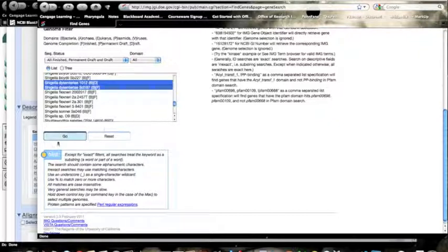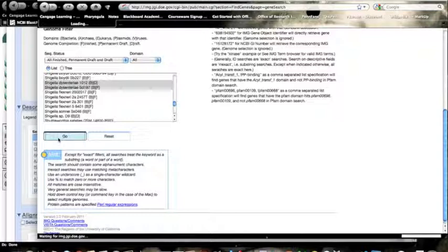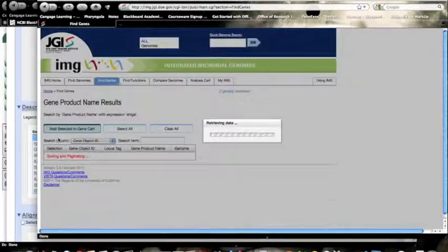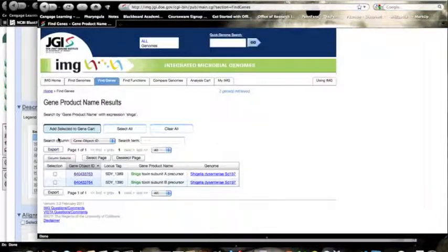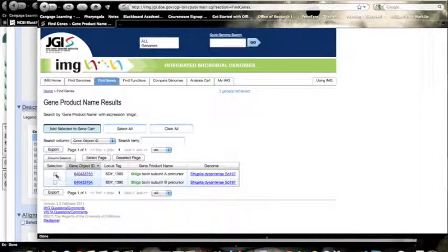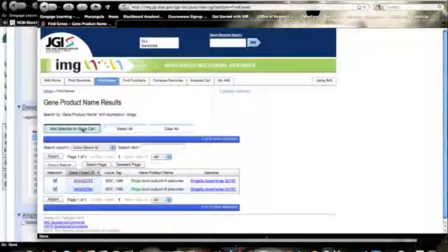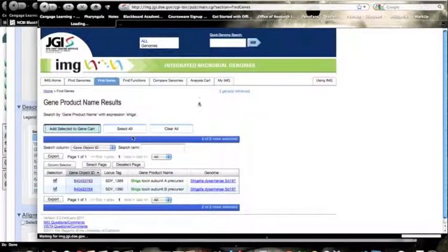Yeah, looks like we've got both of them. We show up both in the one species. We've got A and B versions. That's interesting. We'll add those to the cart.